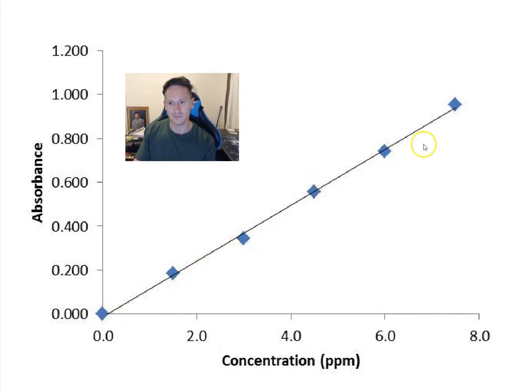So we've got some different points, and then we've got a line of best fit drawn through the points. What essentially happens here is you load the AAS machine with different samples of the analyte you're testing. So for this dot here, we had a metal of a specific concentration, and we know what the concentration is. So you're calibrating it. That's why it's called a calibration curve or a calibration graph. Whatever this corresponds to, it was loaded into the machine, and the absorbance reading was read to be this number, and that's why this point was there. A second sample, third sample, fourth sample, fifth sample. So you do a bunch of samples of known concentration, and you get this curve or this graph.